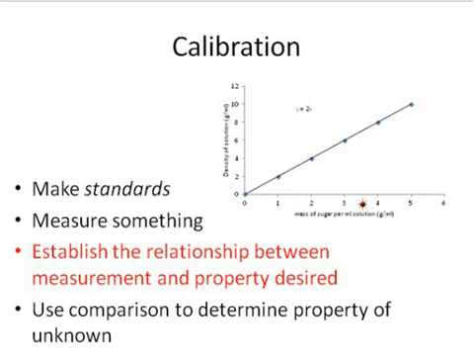And so in this case, we would say this is a plot of density of solution in grams per milliliter versus the mass of sugar dissolved in the solution per milliliter solution in grams per milliliter. This coordinate here, the y-axis, is referred to as the dependent variable, and this axis here, the x-axis, is referred to as the independent variable. So what we've done is we've constructed axes. We've labeled the axes.